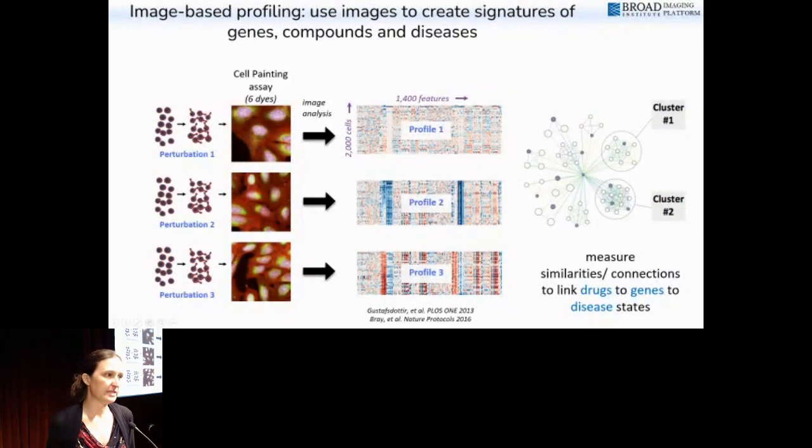this assay on their entire compound library. So 2 or 3 million compounds they can capture this type of data for, and it's quite inexpensive. It's generally on the order of $1 or $2 per well, or $1 or $2 per sample. So this is really key to understanding the whole rest of the talk. I probably should have said that before I went through this slide. So if you've tuned out, you probably should tune back in.